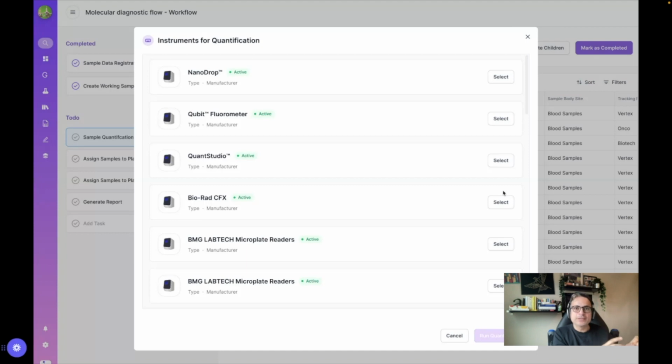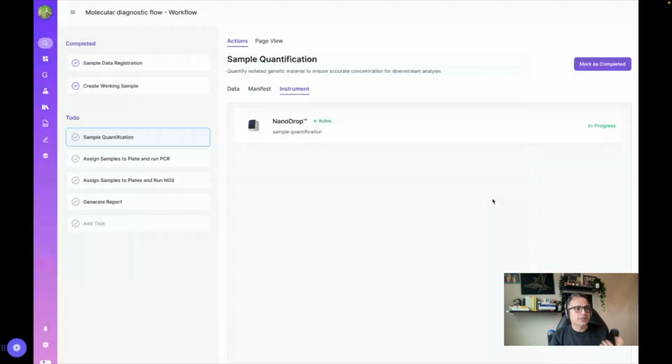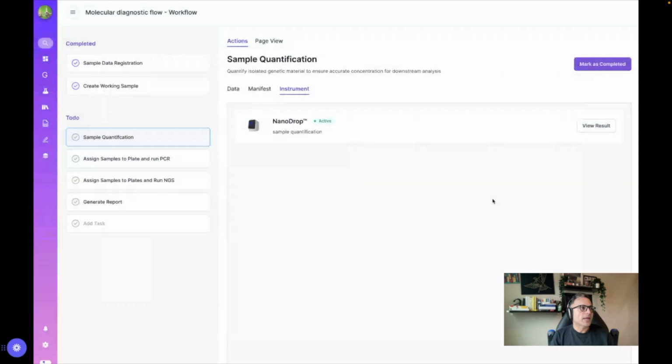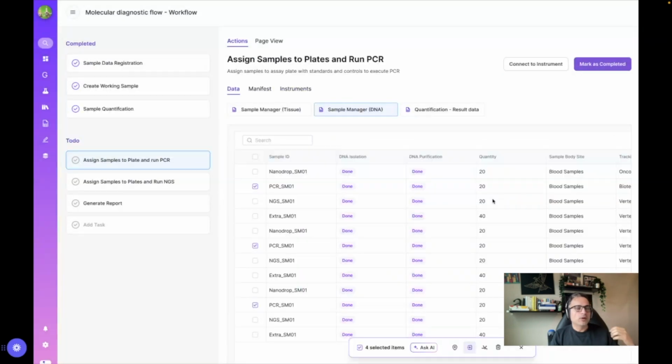If it's qPCR, for example, it picks up the data and pushes it to the secure cloud. Once that data is in the cloud, it becomes semi-automated. You can bring that data in, and if it has metadata and results, you can see that in this LabSheet format and connect it back to all the steps that you've done in the past. So that linkage never gets broken.